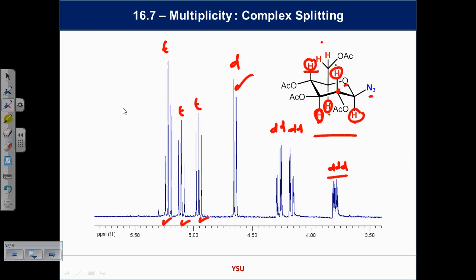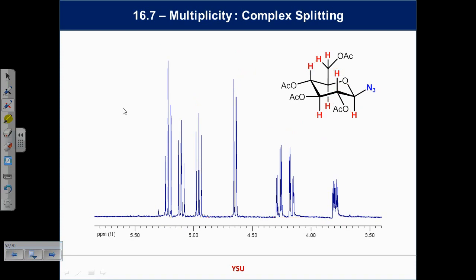I want to finish this off by just looking at these signals down here because they're the most complicated and it'll answer your question. If you look at this system, I get rid of all that noise, this proton and this proton at the back are not the same as each other. It's a CH2 group, but if you ran that test with deuterium and you swapped out one of those hydrogens for D, and then you swapped out the other hydrogen for D, you get diastereomers. These protons are said to be diastereotopic. So therefore they're not showing at the same place. Okay, and those two protons are here. So this is an interesting concept in which, because they're different, they couple each other, even though they're on the same carbon. And because they have one neighbor down here, they will couple that. So if you couple two different protons twice, what shape do you expect?